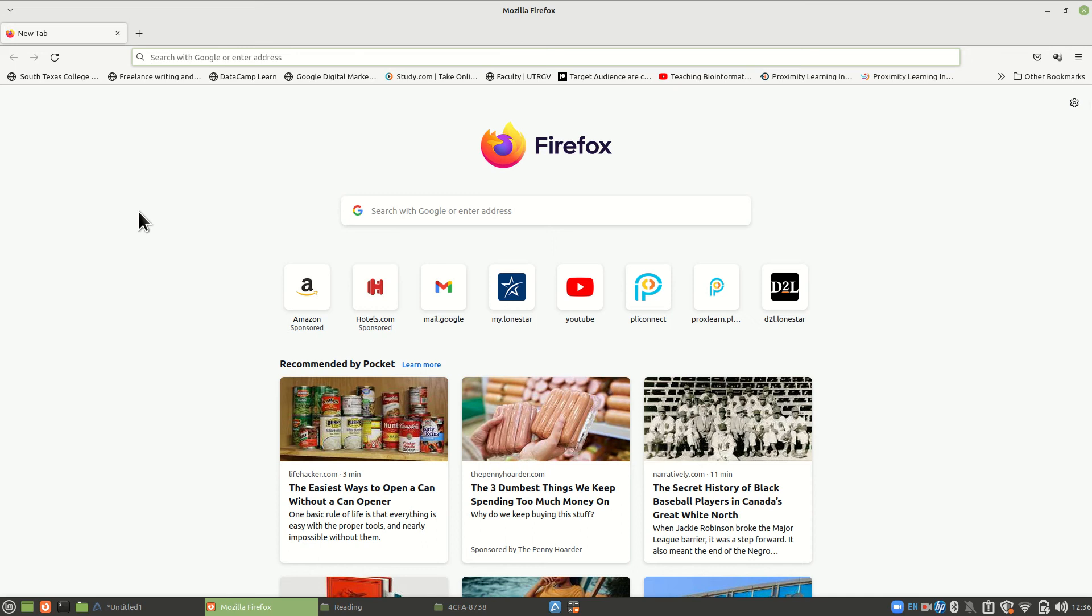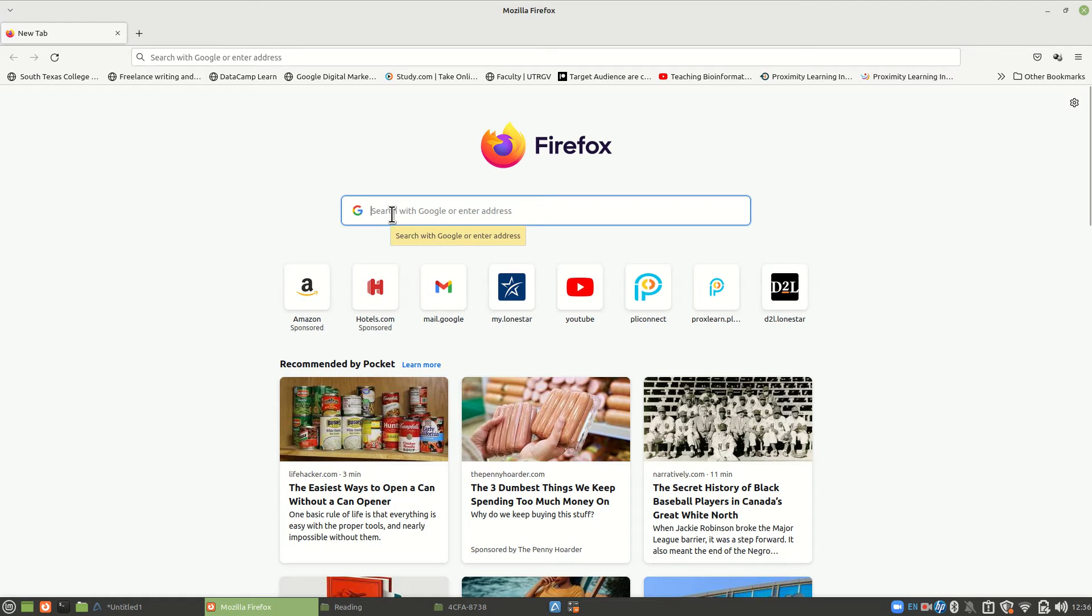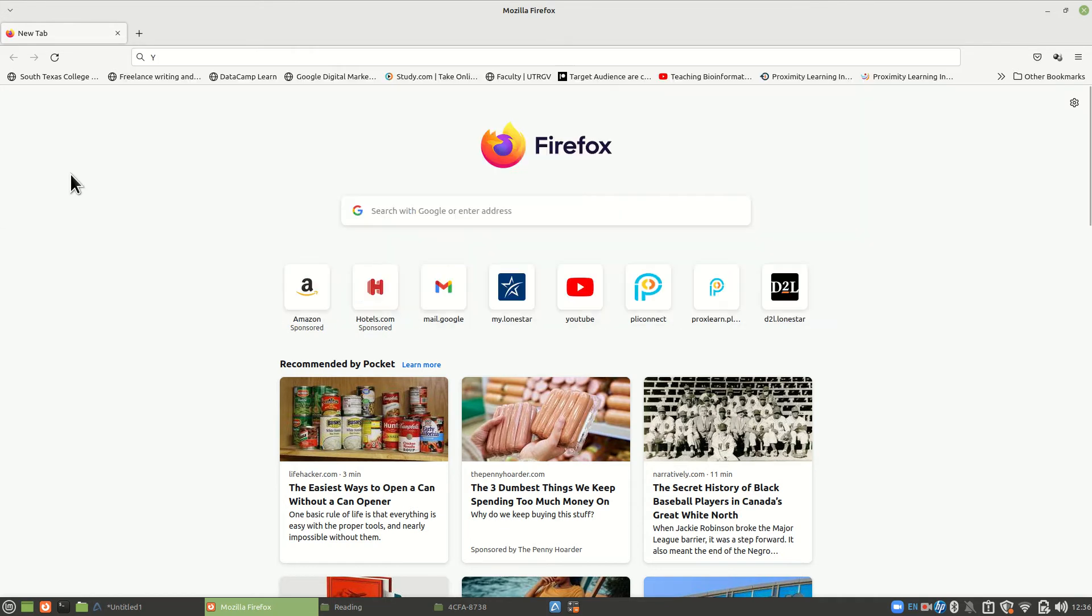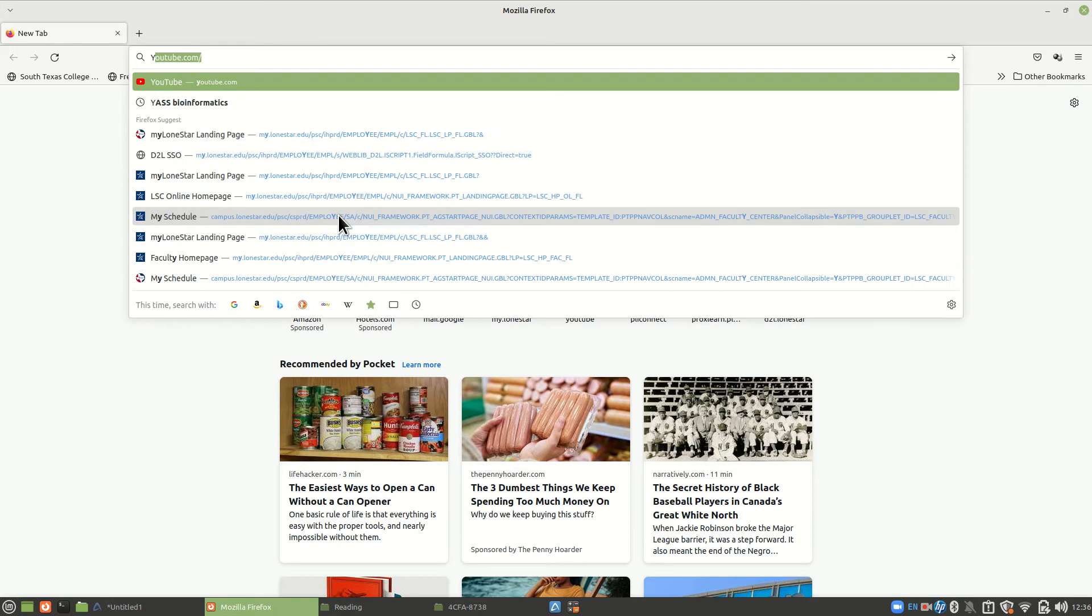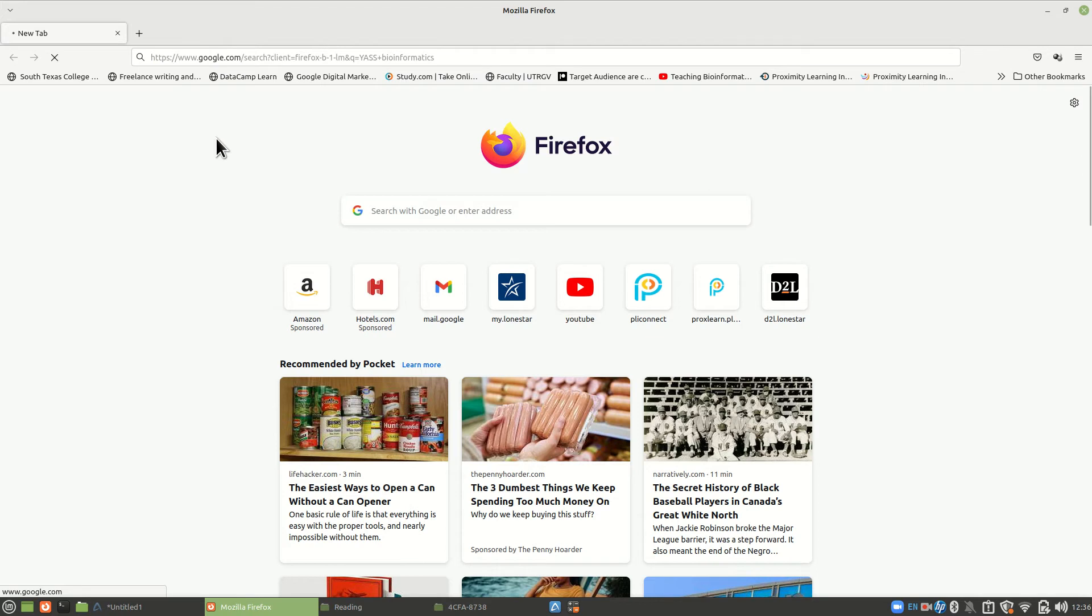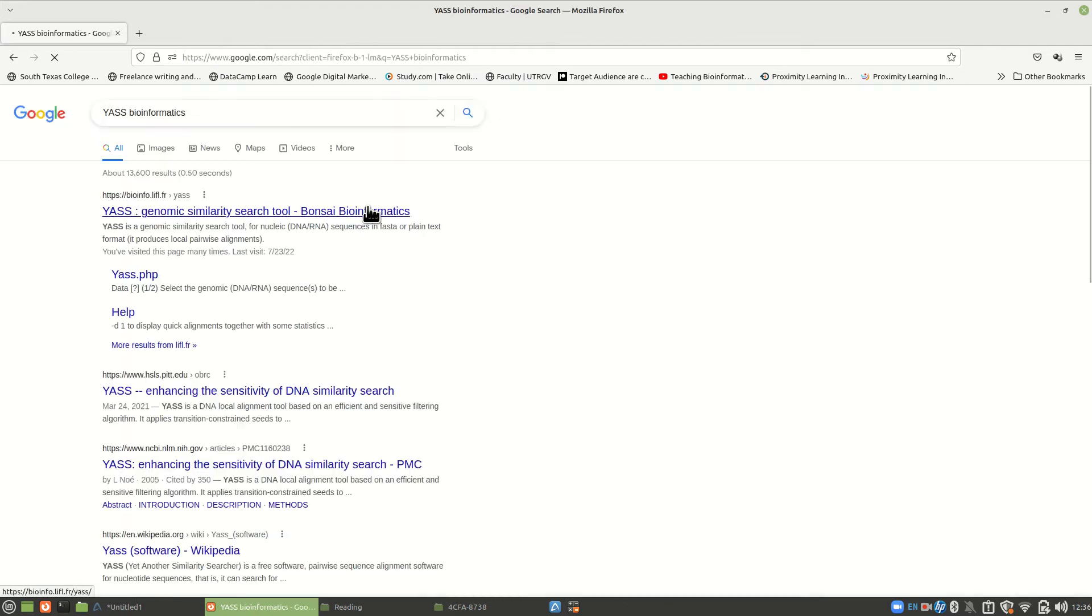All right, having just done our dot plot videos, let's move on now to YASS. It's another program that we need to learn to use. And to do that, let's go to Google and type in YASS, but you need to type in YASS bioinformatics.